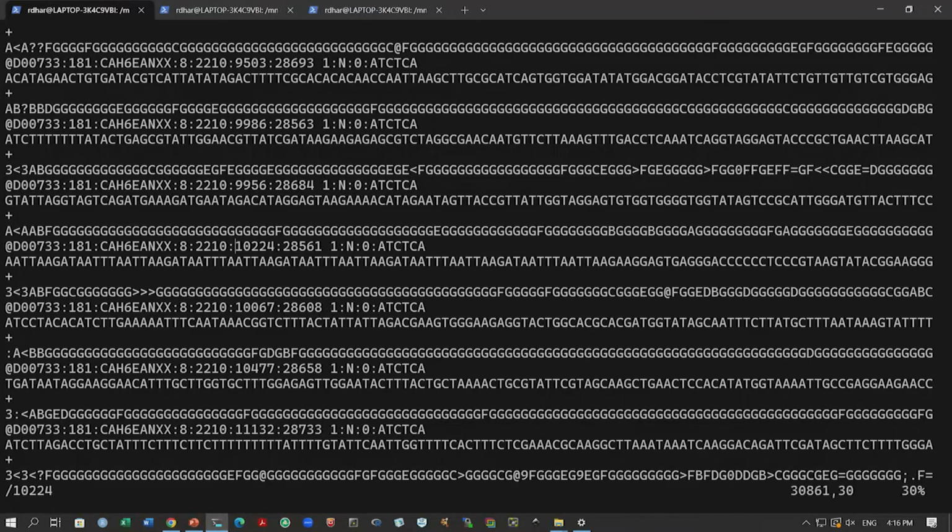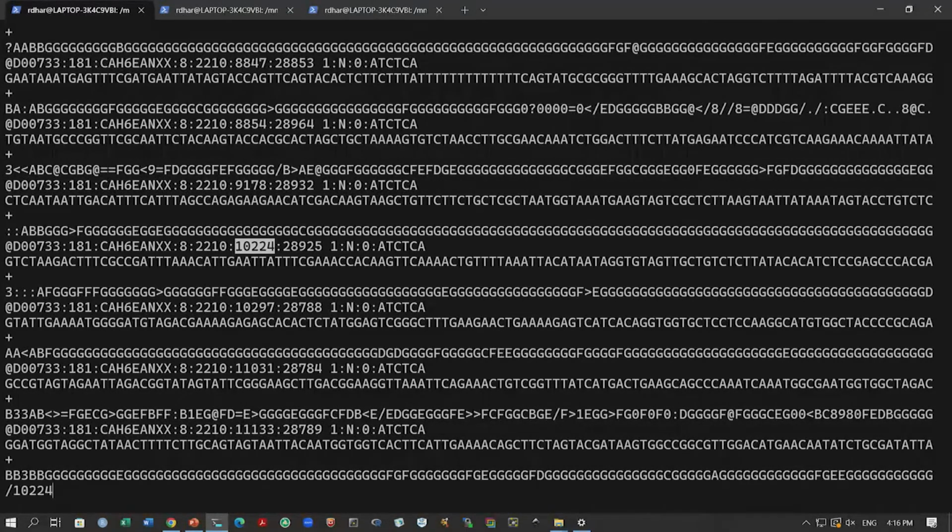We can press enter, and if you want to search again, you just press it again, and you will find another instance of this. At the same time it will tell you where it is finding these terms or numbers. This is the line where it is finding it, and this is the column, and it also gives you an idea where in the file you are. So, here it is 31%, we have traversed 31% of the file, so somewhere in the middle here we are finding these terms. That is a great thing, we can search and traverse through these files very easily.